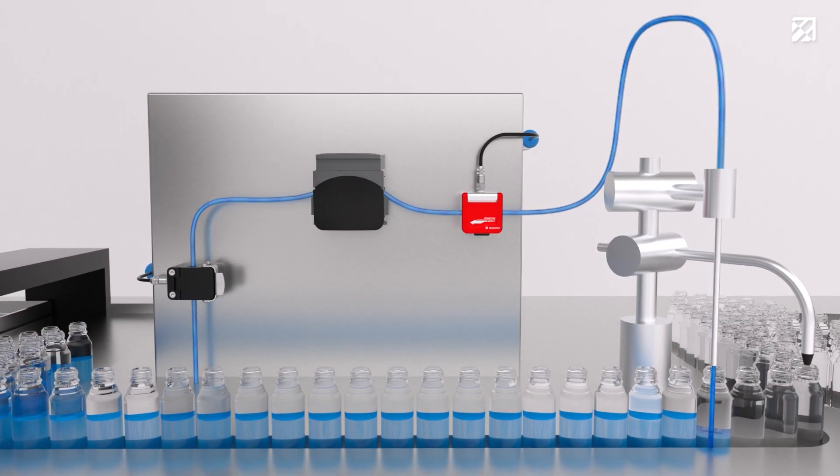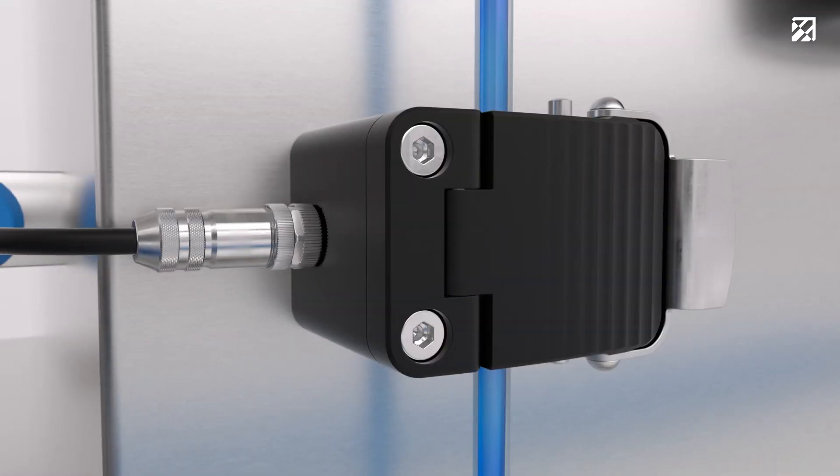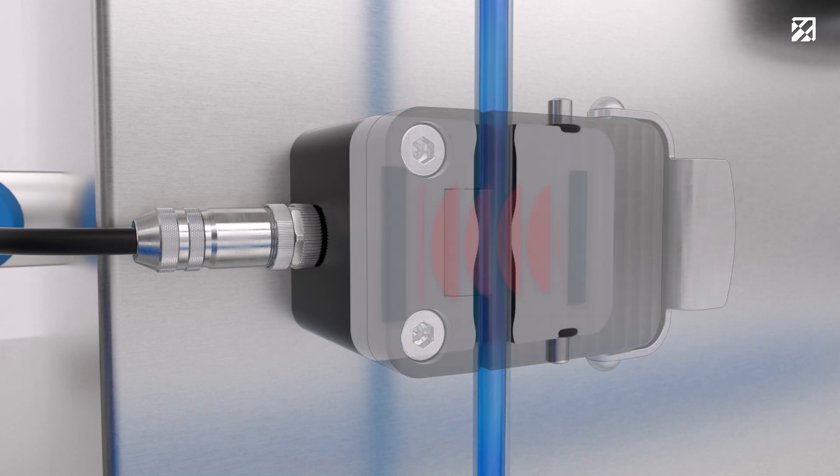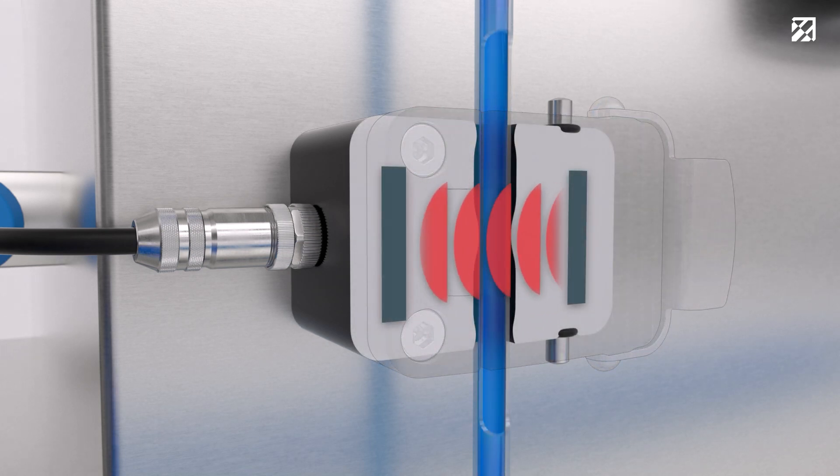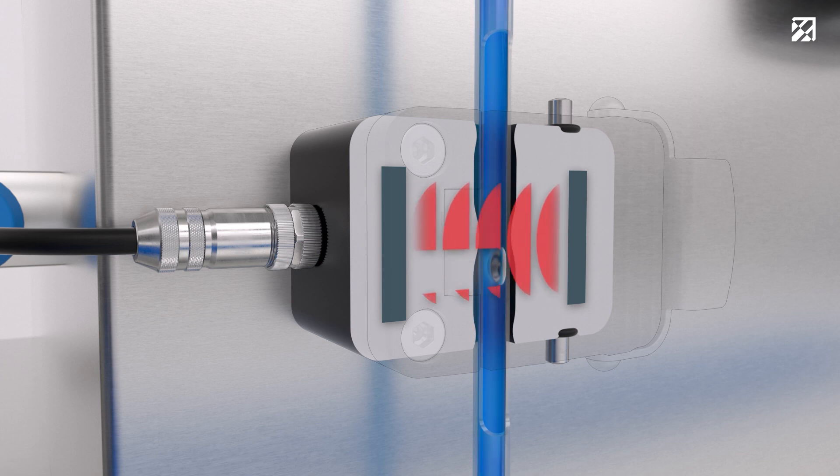With our SonoCheck ABDO-6 air bubble detectors, we offer non-contact clamp-on ultrasonic sensors which detect smallest air bubbles in the tubing, for example, to ensure exact volume dosing in vials.